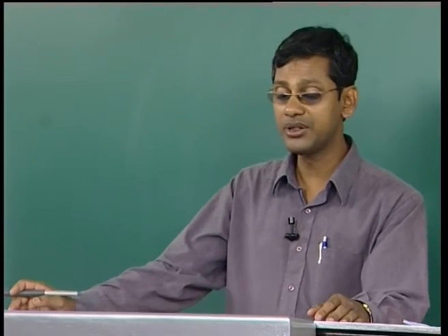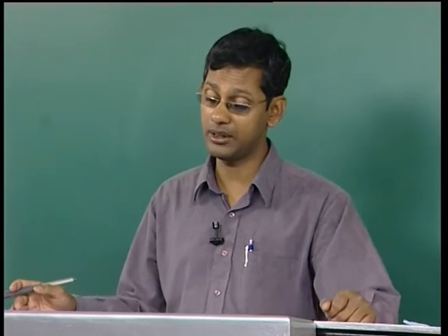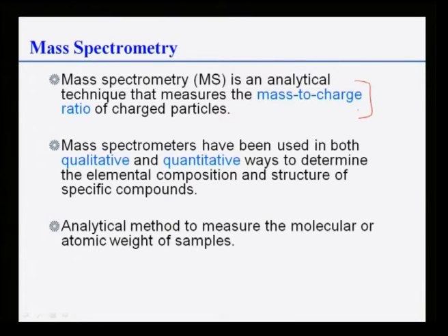It has been used in both quantitative and qualitative analysis to determine the composition and also the structure of specific compounds. Not only that, it allows us to be used as an analytical method to measure the molecular and atomic weights of the sample. So it has versatility, as you can see. It gives a host of information, and I have listed only a few of them in this slide.